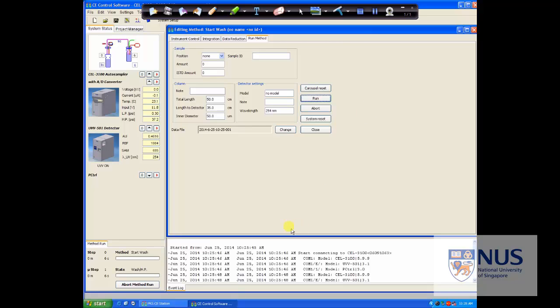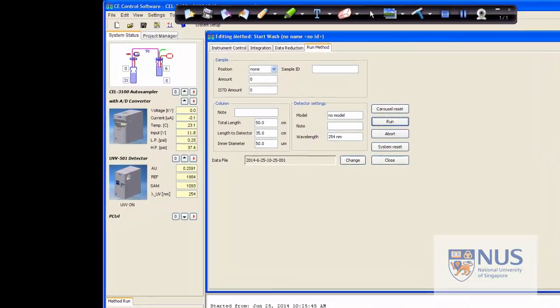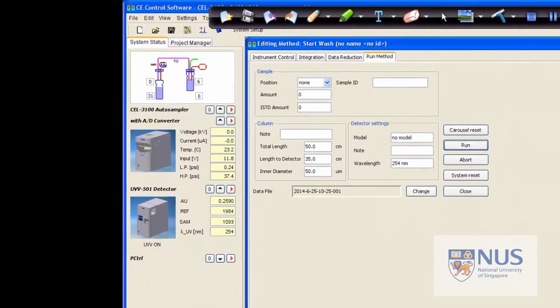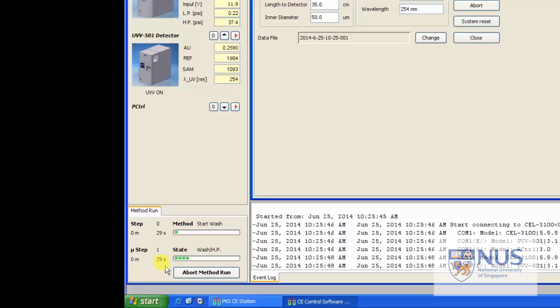If we walk down, you've then got two little instrument pictures. Both of them have what looks like a computer on them, and these show you the settings that the method has written into those pieces of kit. Don't alter them, they're set up correctly.